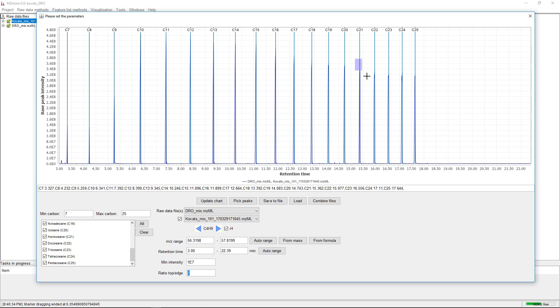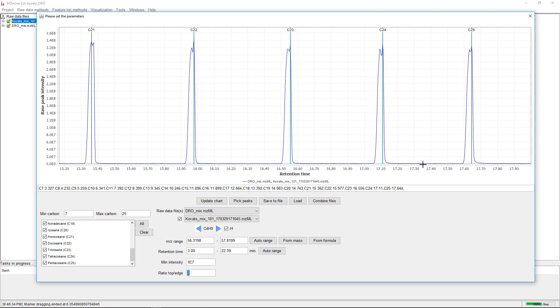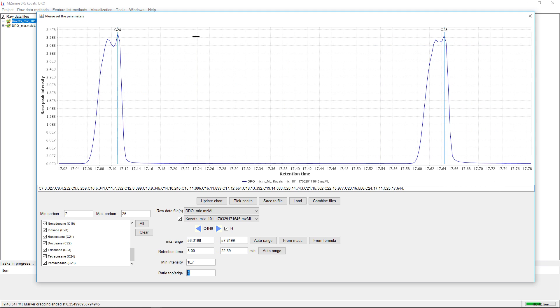One thing: if you zoom in, you might see that some of the peaks do not have a perfect shape.